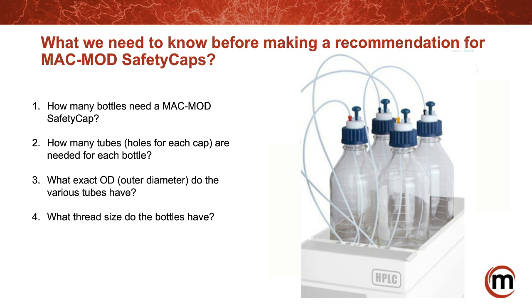And what thread size do the bottles have is another question. Generally, the bottle cap, as I said before, is GL45, but there are other thread sizes available too.